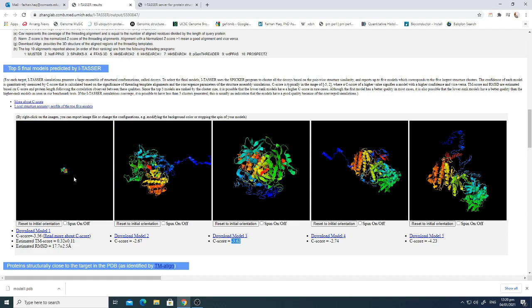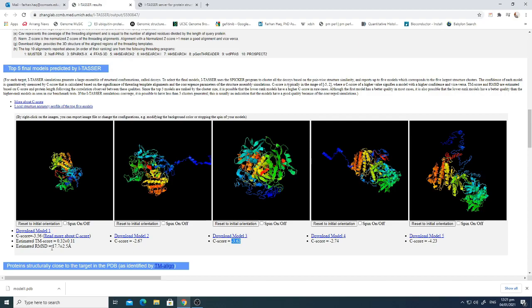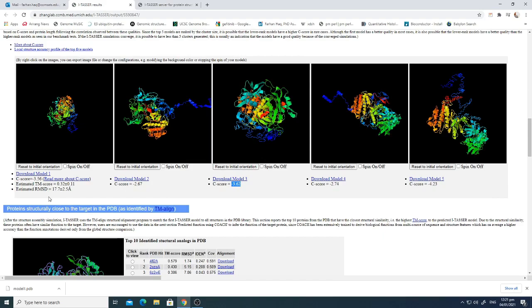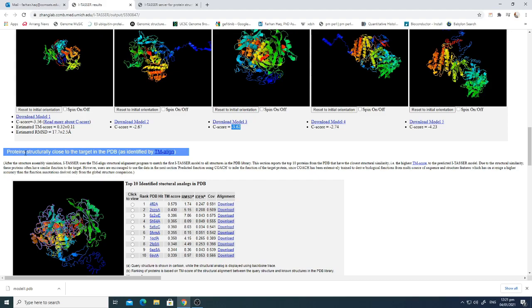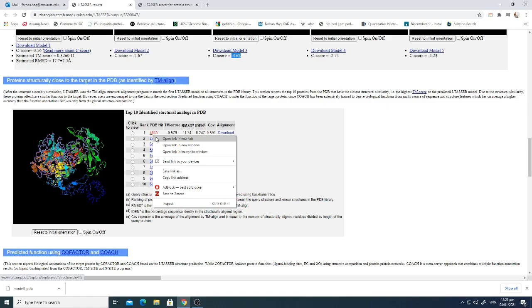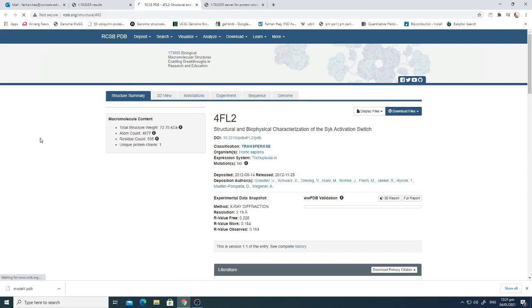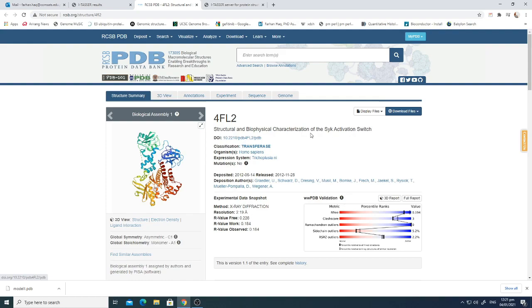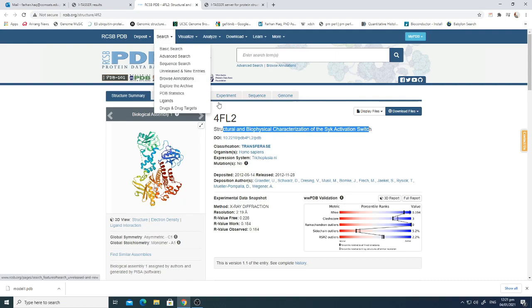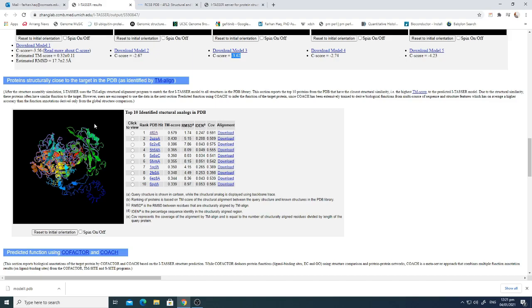Depending on your protein of interest, you will get different results; this is just a tutorial showing how to find the best structure. The TM-score and RMSD (root mean squared deviation) scores are also mentioned. A list of proteins structurally close to the target in the PDB is provided. Clicking on a PDB hit takes you to the RCSB website — for example, showing the biophysical characterization of the SYK activation switch protein, classified as a transferase.